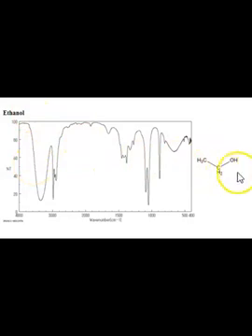But let's go over here for a second. There's something else going on with an ethanol: there's that CO bond right here. Now, we're going to see on the absorption table that at 1000 to 1320 we should have something. The absorption table tells us if you have this, you should see something between 1000 and 1320. So there's 1000, and then there's 1320. Okay? So, which one is it?